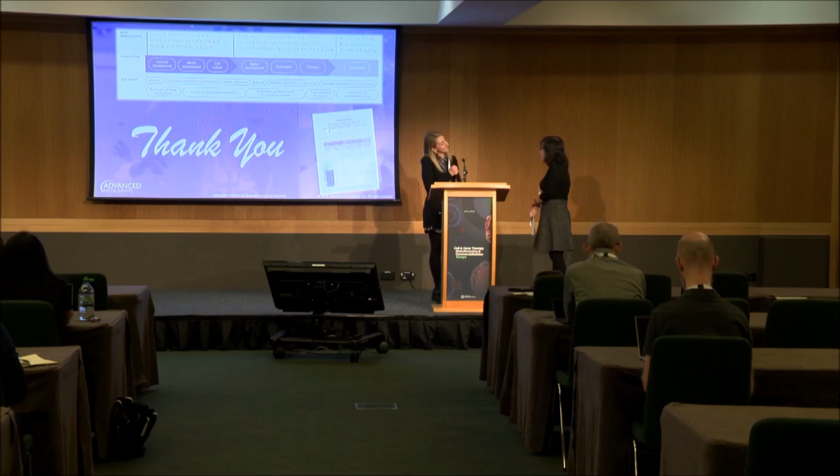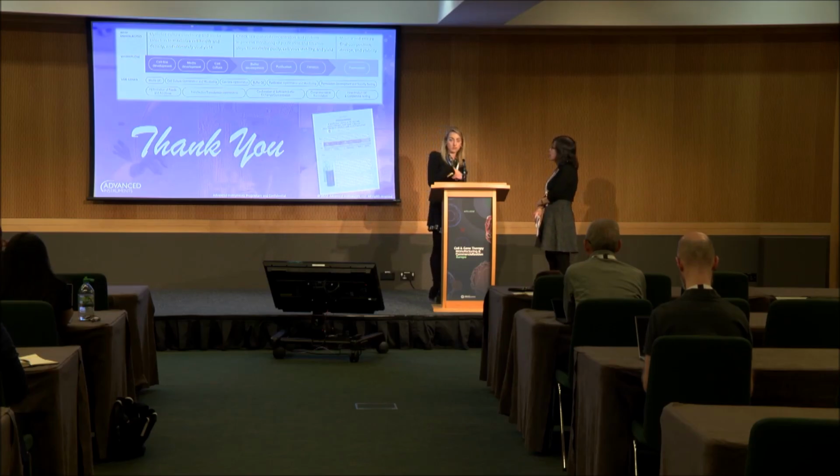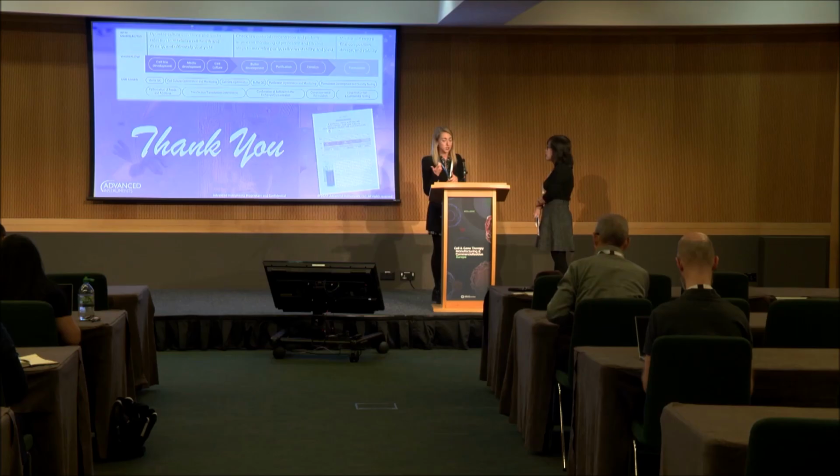My next question is, there's going to be a change in the European Pharmacopoeia Osmo chapter next year. Can you talk us through the changes? Yes. With the European Pharmacopoeia in January 24, there will be a change. There are various different changes within this, but really the biggest difference is within your daily verification check or your accuracy check that is monitored within the EP.